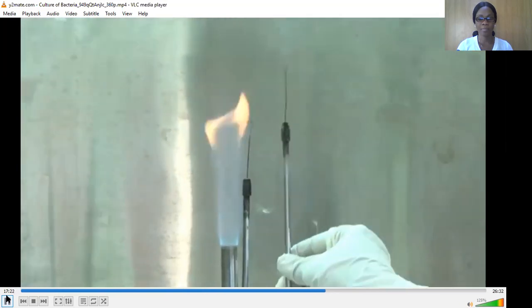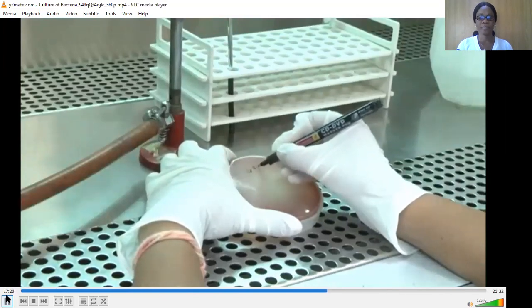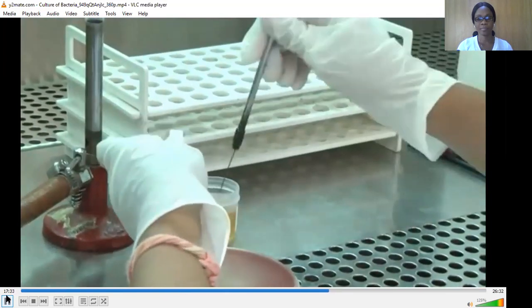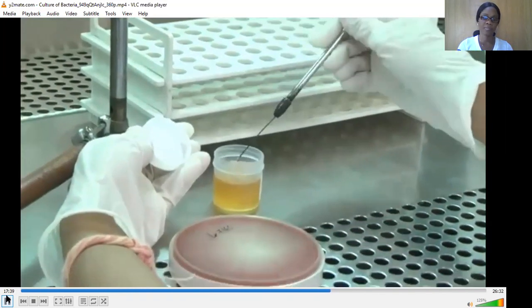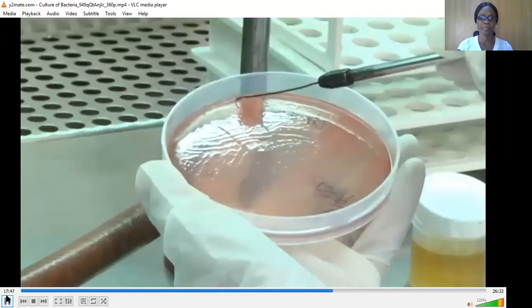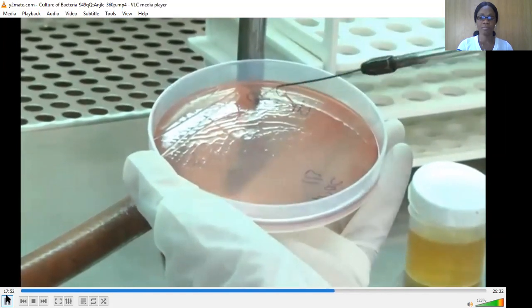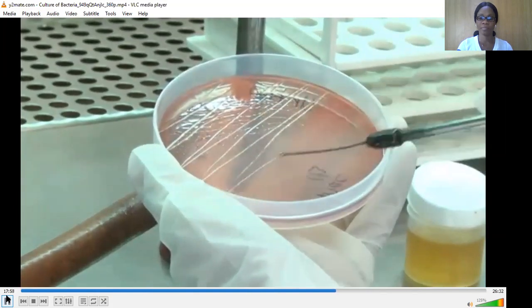Method: flame a calibrated wire inoculating loop and allow it to cool down. Label the base of plates which need to be inoculated. Mix the urine thoroughly and remove the top of the container. Insert the loop vertically into the urine, allowing the urine to adhere to the loop. Spread the loop full of urine in a straight line onto the middle of the plate. Then, starting from one end of the line, spread the inoculum in a zigzag fashion across the middle line, covering an adequate portion of the surface of the agar.